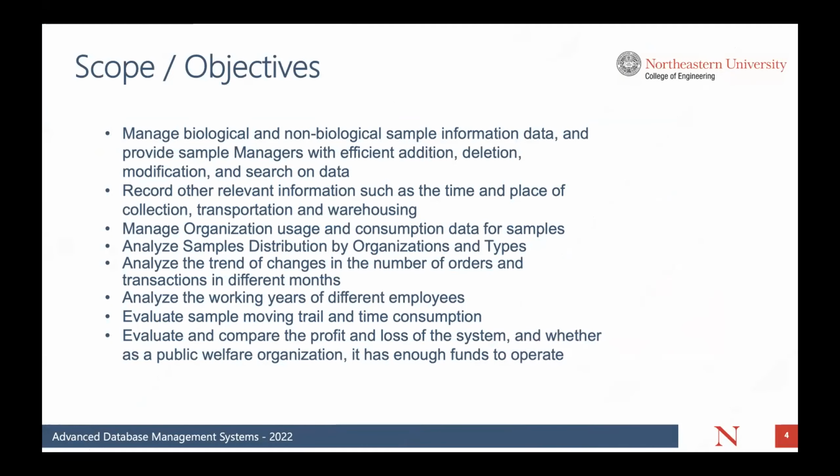These are our project objectives. First, it can manage biology and non-biology sample information data and provide sample managers with efficient addition, deletion, modification, and search on data. And it can record other relevant information such as the time and place of collection, transportation, and warehousing. It also can manage organization usage and consumption data for samples.